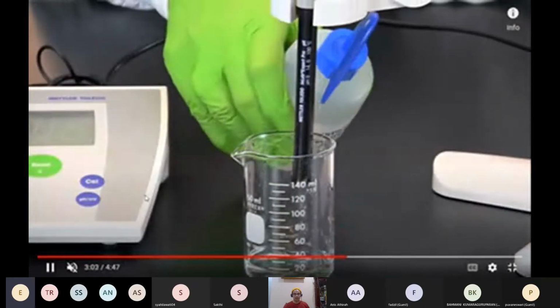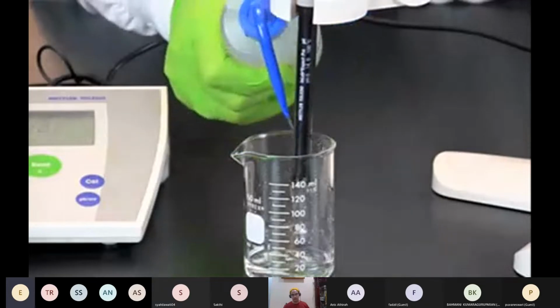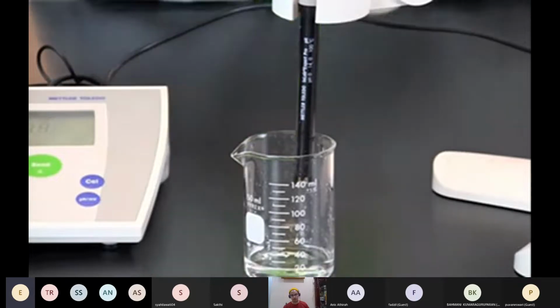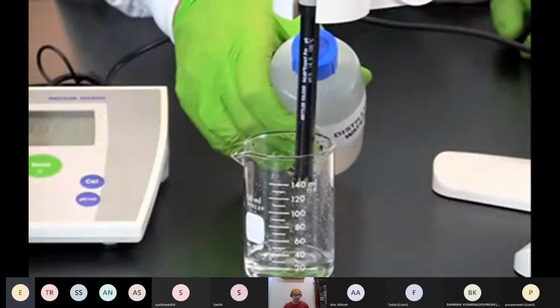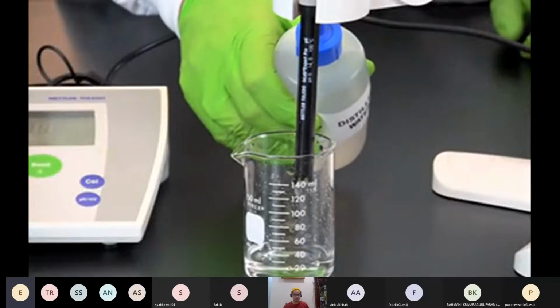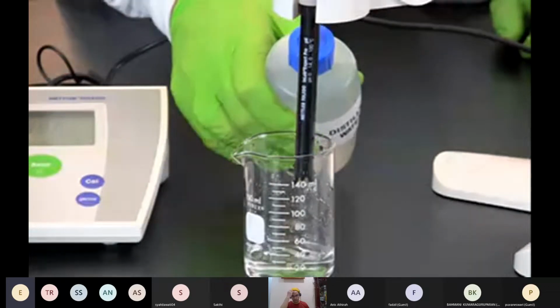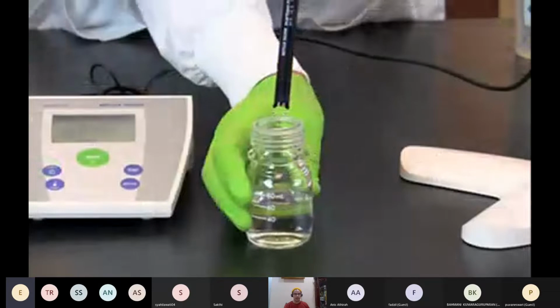And also, as you can see, sepanjang proses calibration ni, setiap kali dia tukar solution, dia akan rinse. Kalau dia nak test pH 7, dia rinse dulu, baru dia dip the electrode into the solution. Bila dah selesai, dia rinse balik, baru dia dip into pH 4 solution.